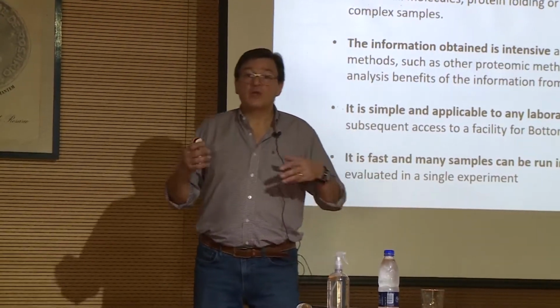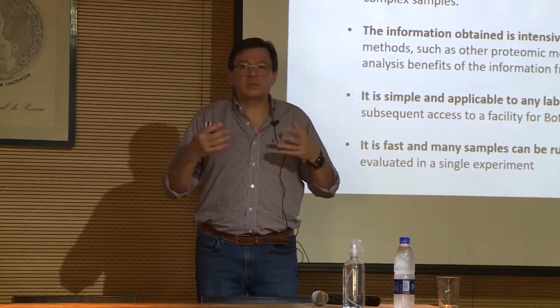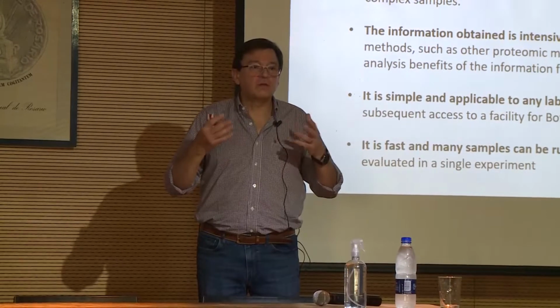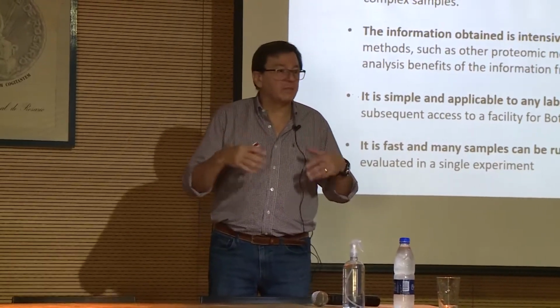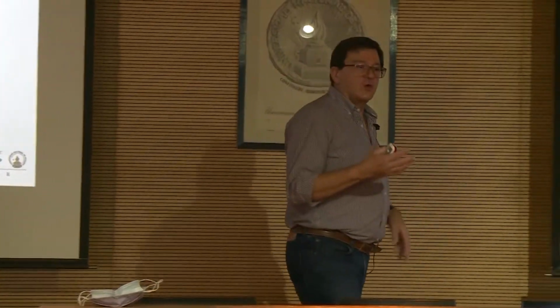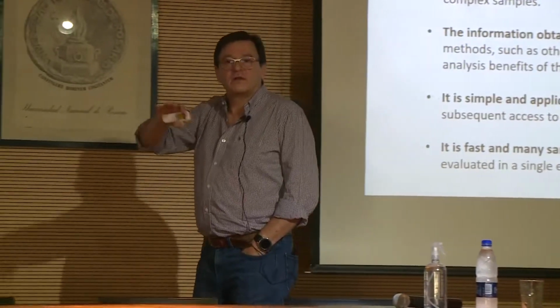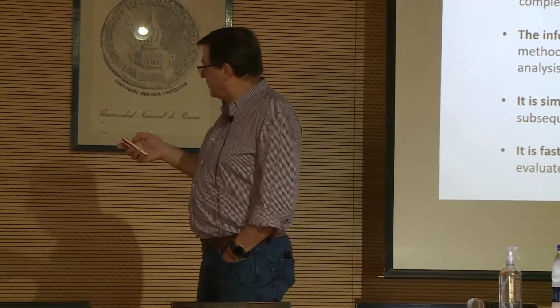Also, when you lyse a cell, you have a lot of proteins that will unfold due to the lysis, and you will have a lot of chaperones interacting with polypeptides. So you don't have to be fooled by the data and take any data as true.